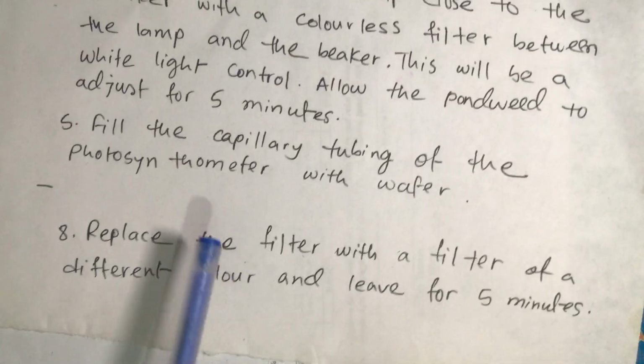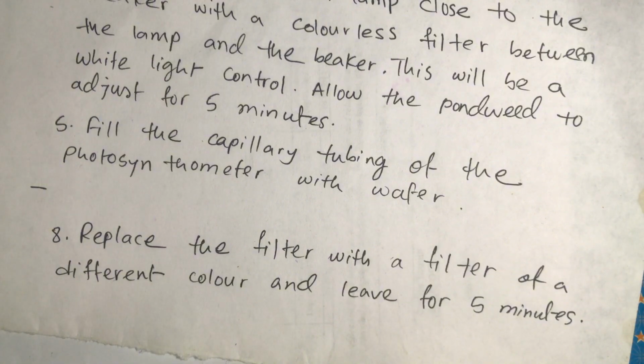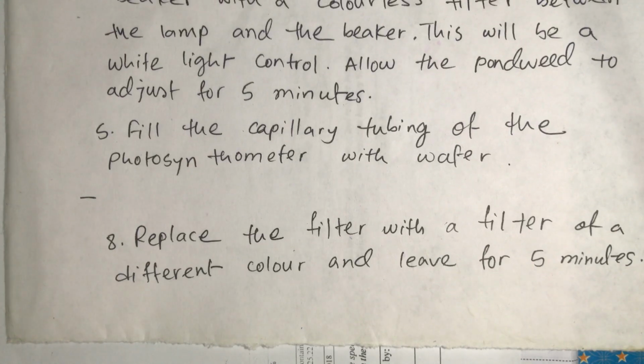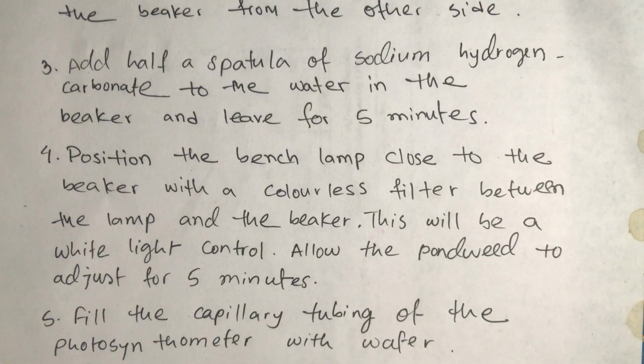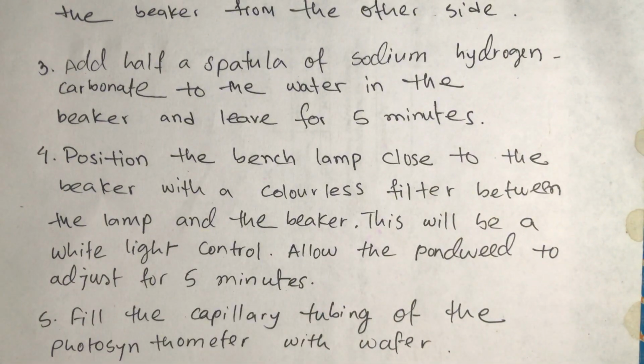Okay. Replace the filter with a filter of a different color and leave for 5 minutes. So what we have to do is replace, as I said before, the colorless filter that is placed, so that we can know the effect of light wavelength. Then this colorless filter is changed with different colors so that we can do the same experiment with different light wavelengths and find the best one among them.